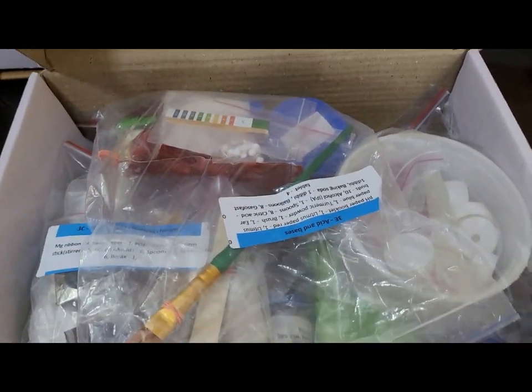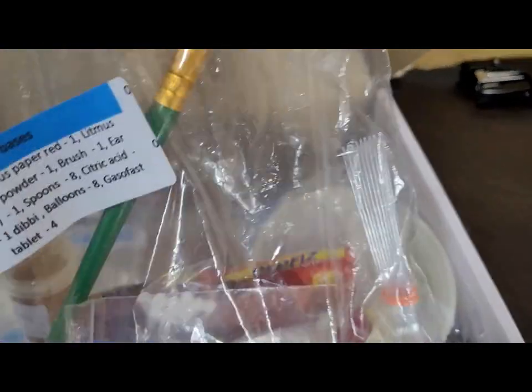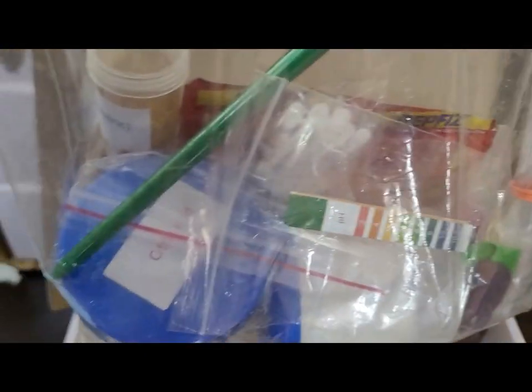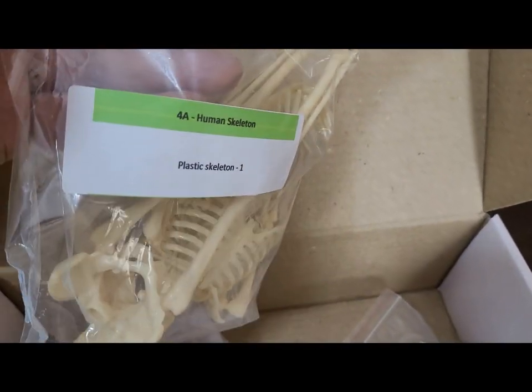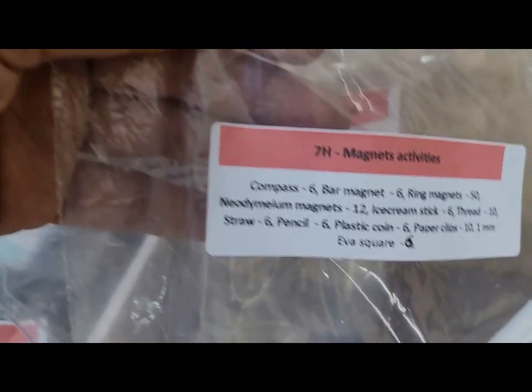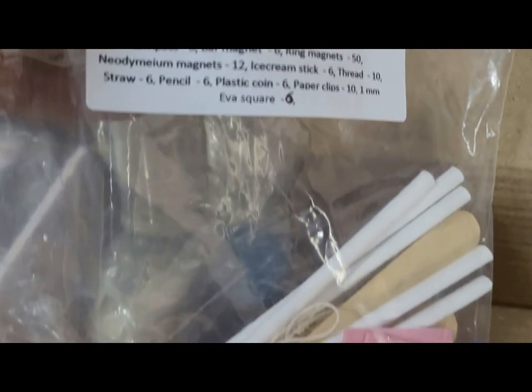It includes material for teachers to demonstrate all 85-plus activities to students. It also has material for students to perform about 65 types of activities. Teachers can divide students into 5 teams, give them the material to perform these activities, and later collect the material back.